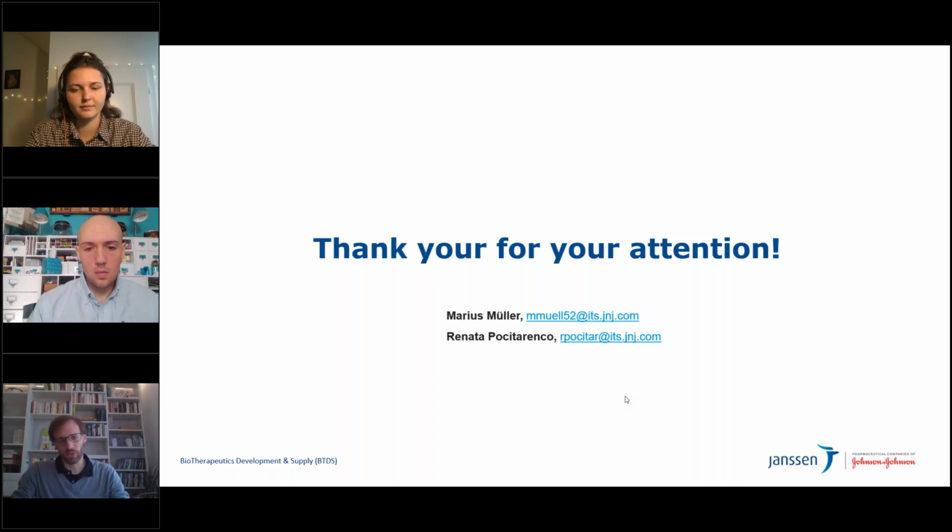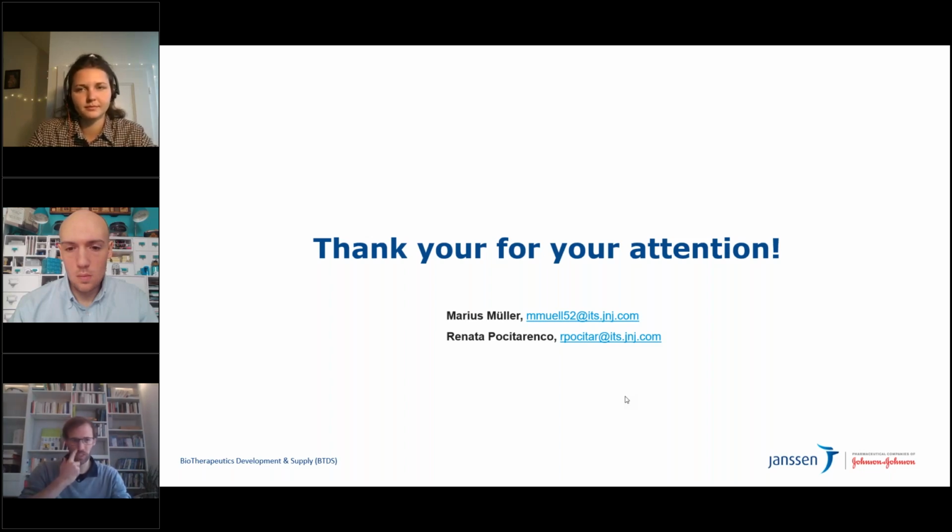On top of it, we also now really have a certain process understanding in terms of how long it takes, when do we have a homogeneous solution, for instance, for the mixing. Those are things that are now possible with having this online analytics. And also just recently, when we established this with our drug substance colleagues, for the UFDF steps, it's now even possible to observe the up-concentrating of material, how long it takes, and get a characterization of the process, which also has not been possible before.